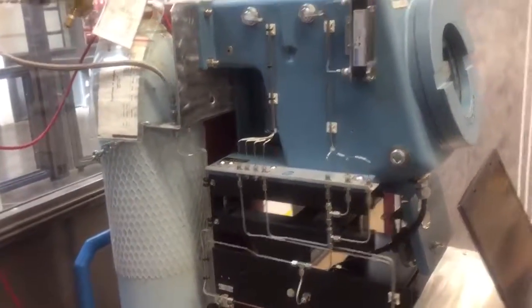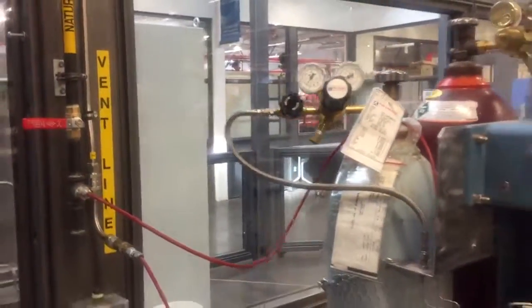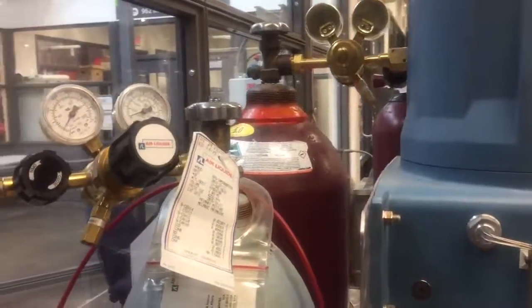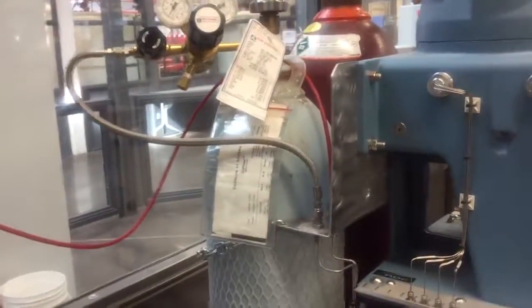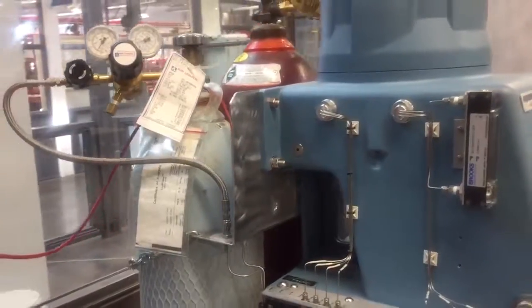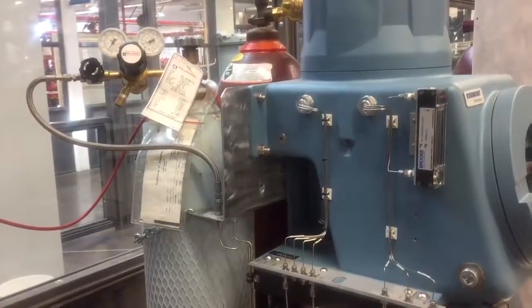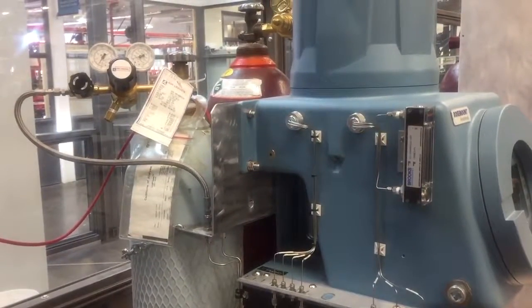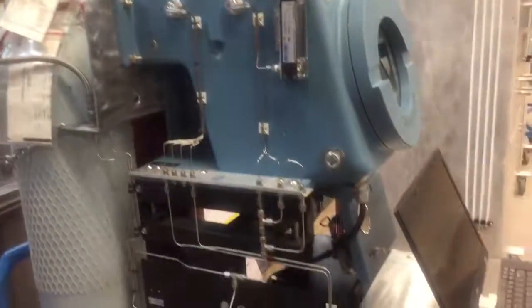Our hazards here on this lab, we have obviously flammable gas, we have natural gas and our helium is also very high pressure, about 2500 psi when it's full. The calibration gas cylinder is about 500 psi. So we've got flammability, pressure hazards, possibility of asphyxiation. Probably wouldn't happen because we'd have to be in a smaller space, but if our helium all leaked out, it could purge all the oxygen out of the room possibly and it would be a hazardous atmosphere.